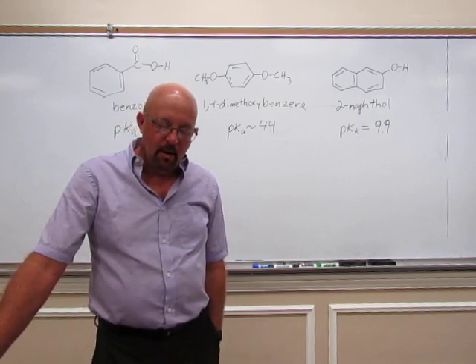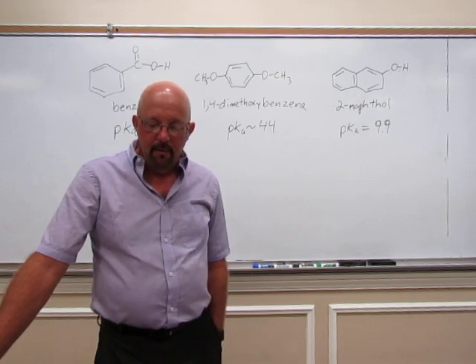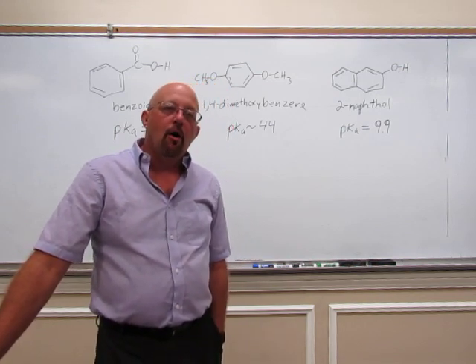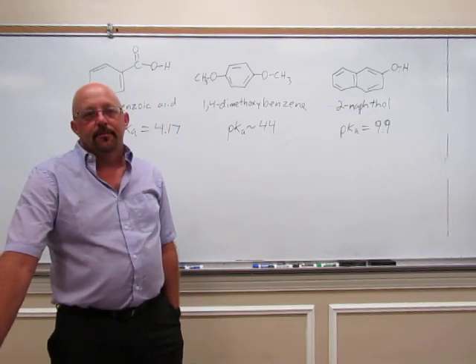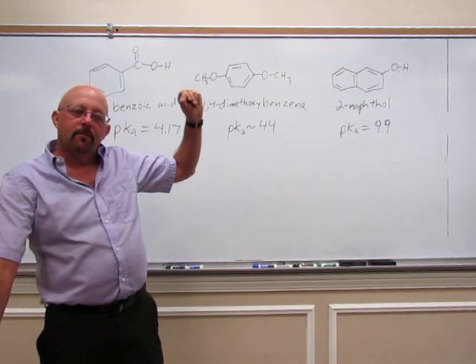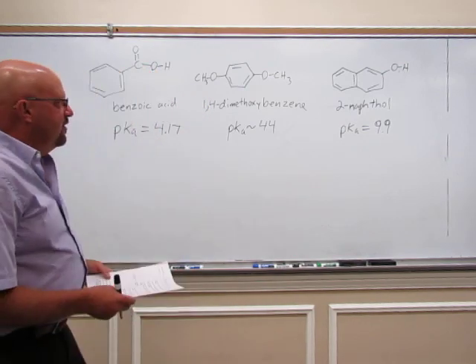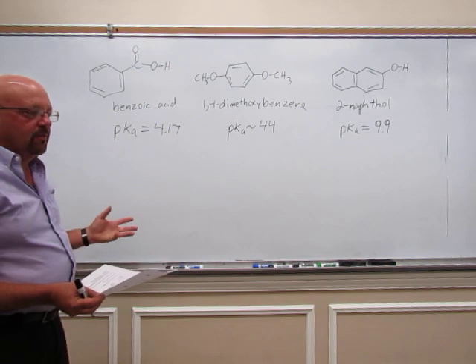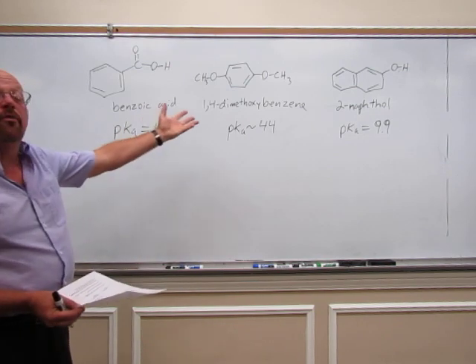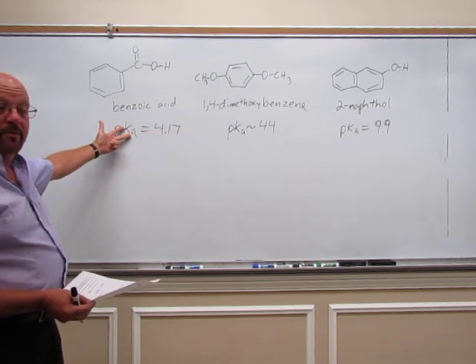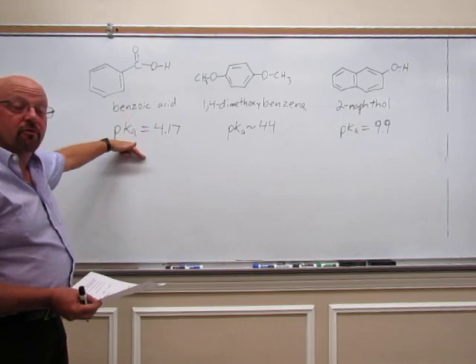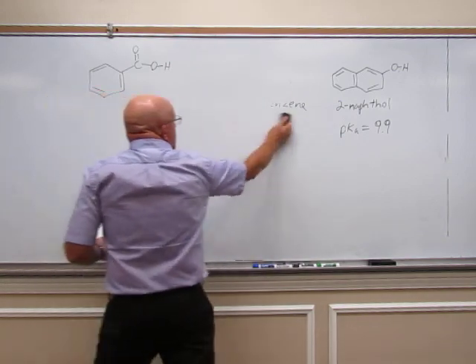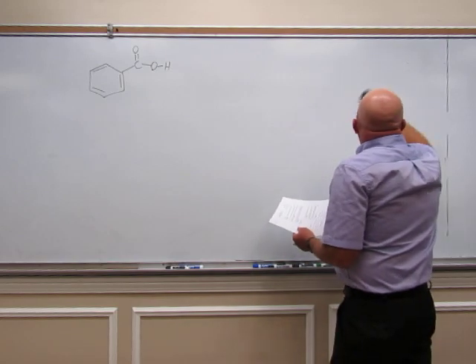Put one of your septa on the top and shake it for three minutes. Now, sodium bicarbonate is a weak base. We have some acidic compounds, so putting in a weak base — which one is it going to react with? It's going to react with the most acidic compound, which is the benzoic acid. Let's take a look at the reaction of benzoic acid with sodium bicarbonate.